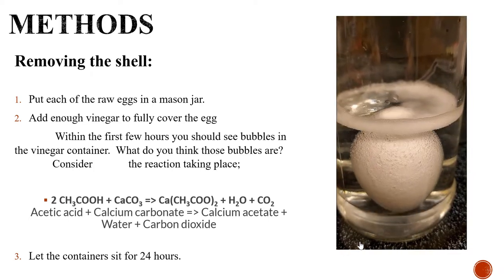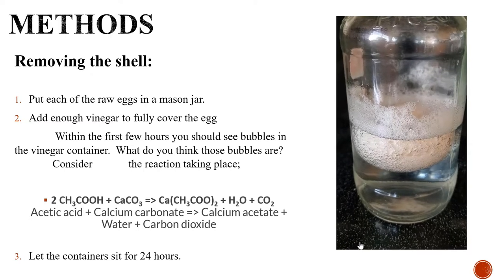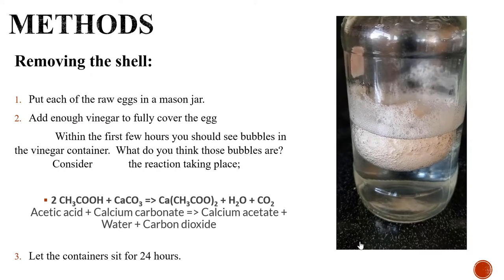Looking at the equation for the reaction between the vinegar and the eggshell, what do you think are the bubbles forming around the egg?